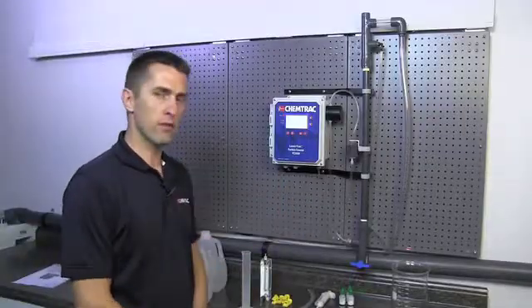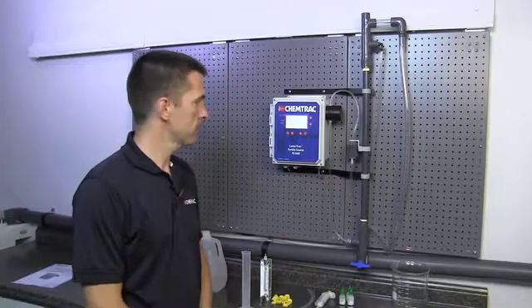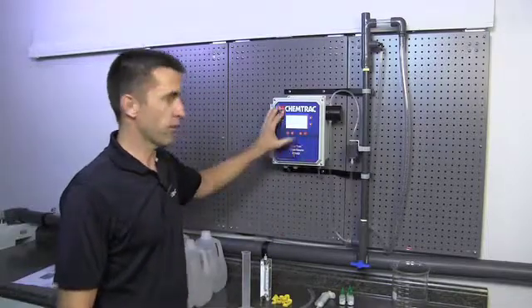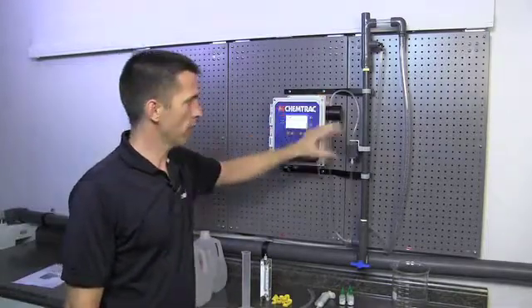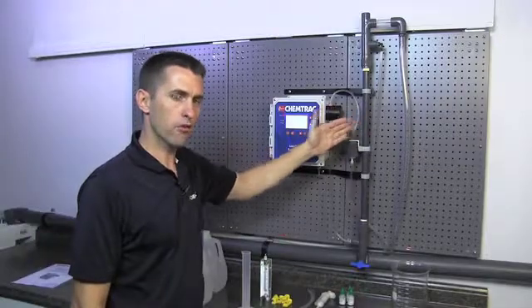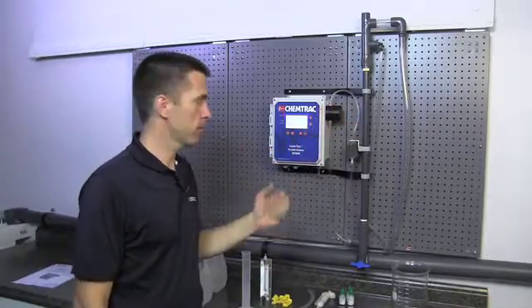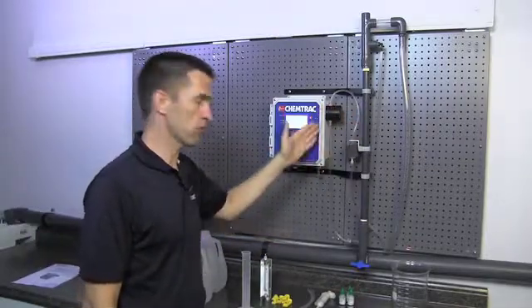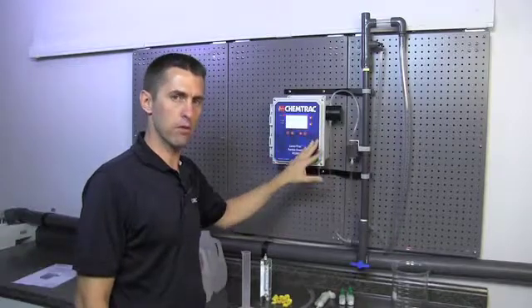Here we have a typical installation of a ChemTrack particle counter. We have the particle counter itself with the external flow cell and the flow control weir. The flow control weir provides a constant head pressure to the sensor to maintain a flow rate of 75 milliliters per minute.